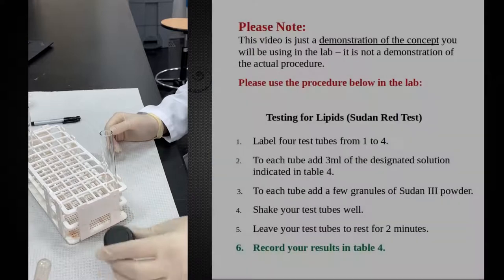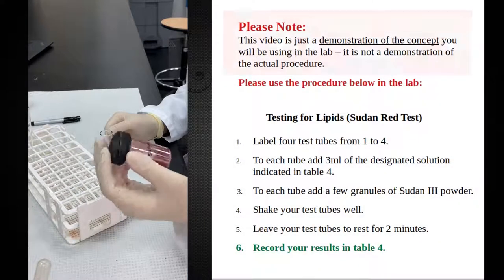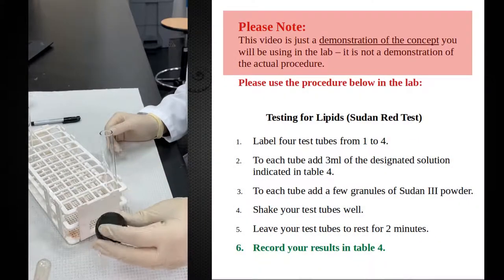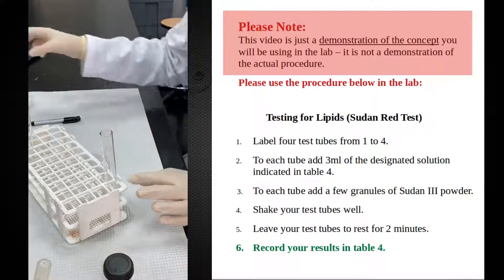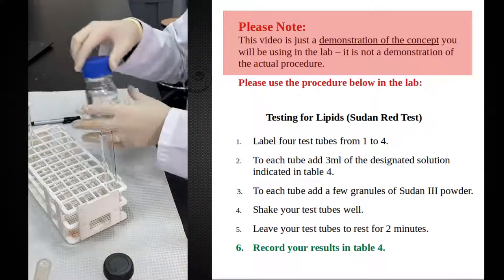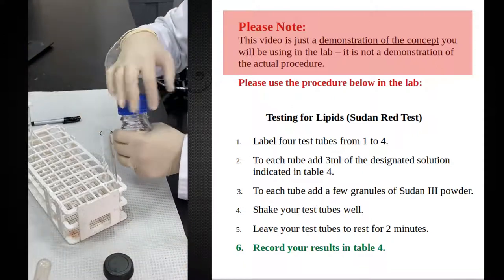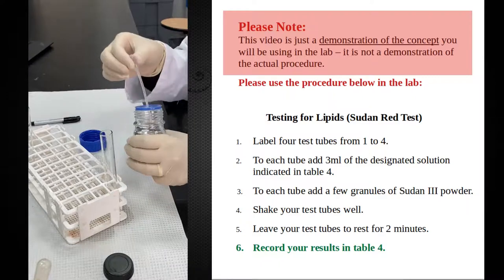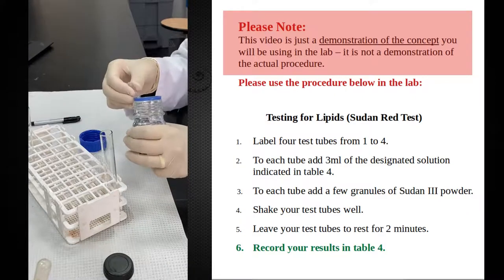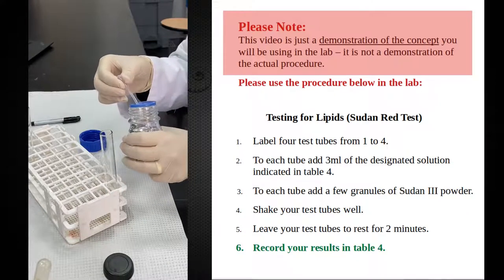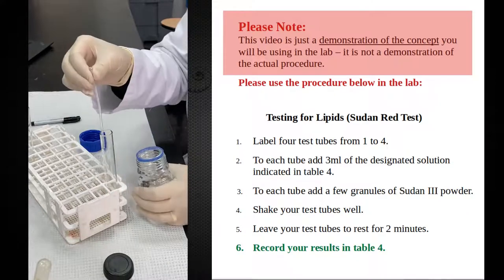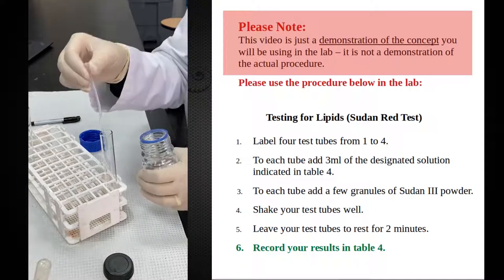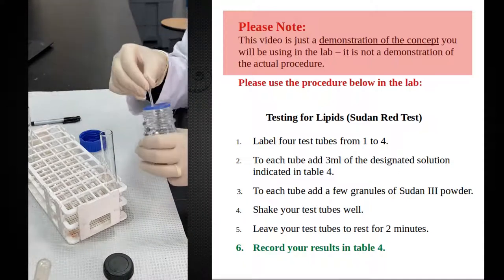I will show you why Sudan powder can be used as a test for lipids, to test for fat. I will put in the same test tube 3 ml of distilled water and 3 ml of oil.